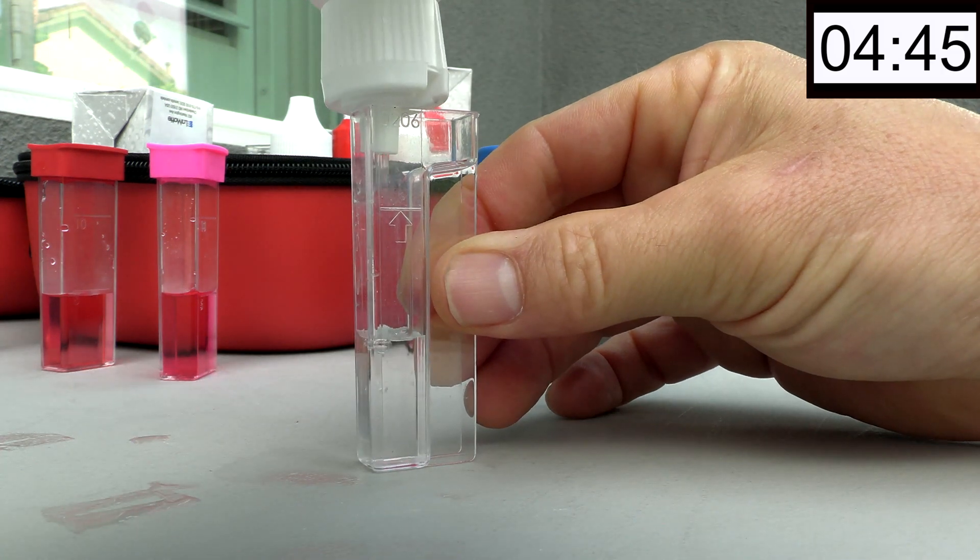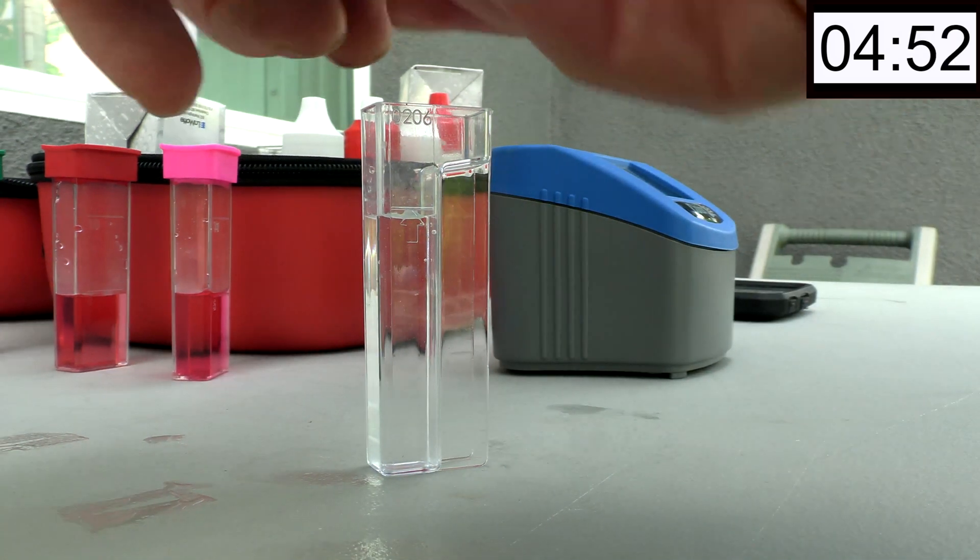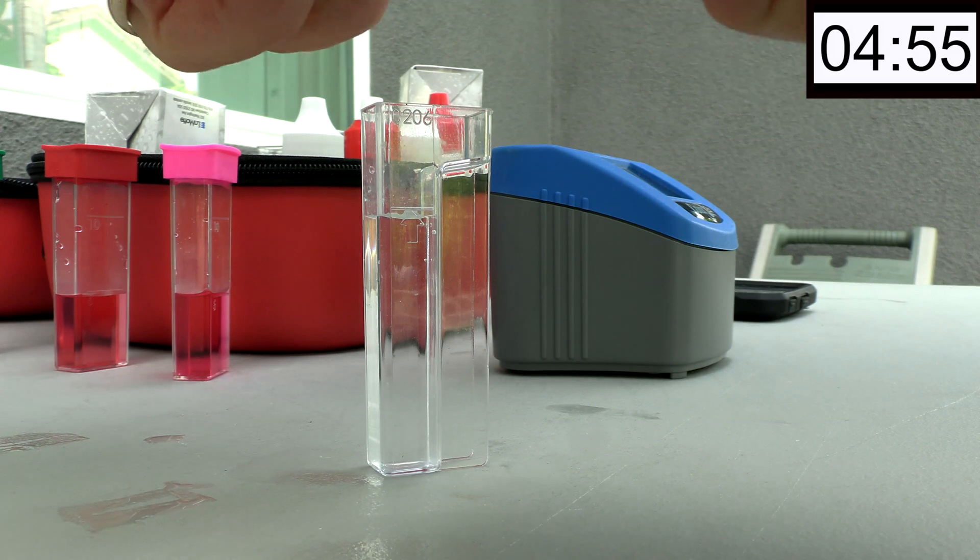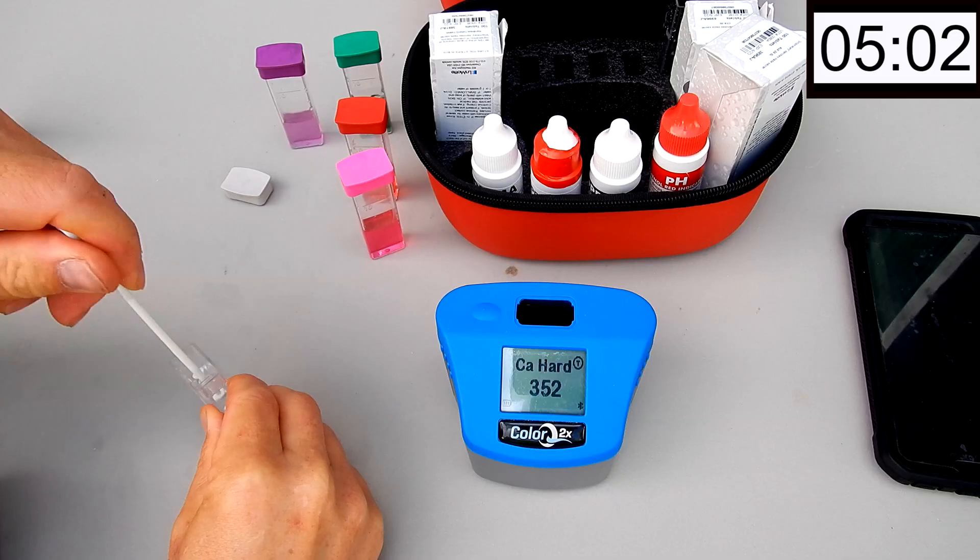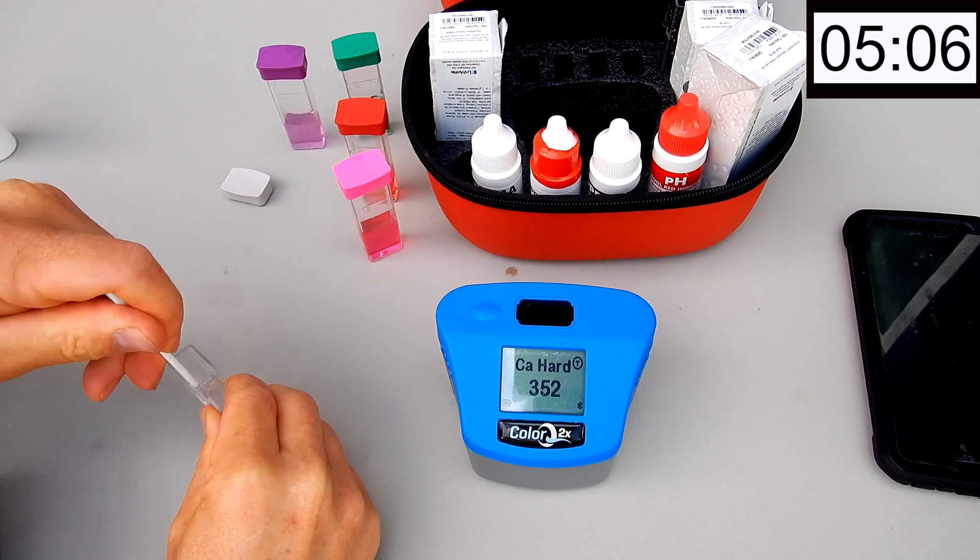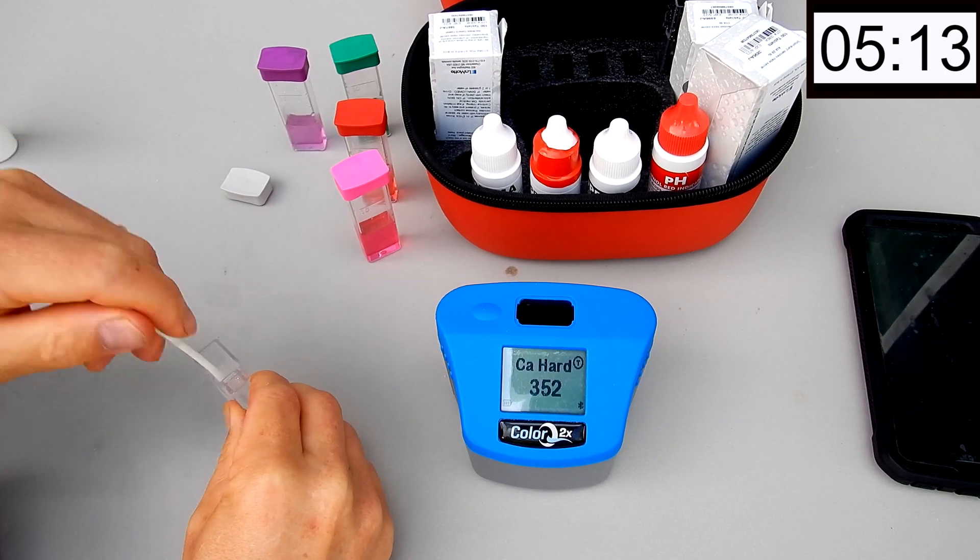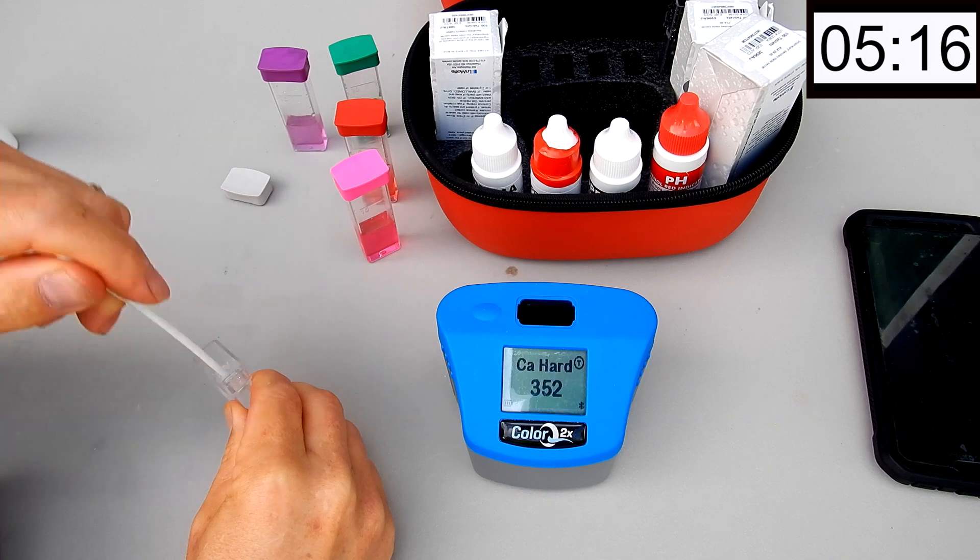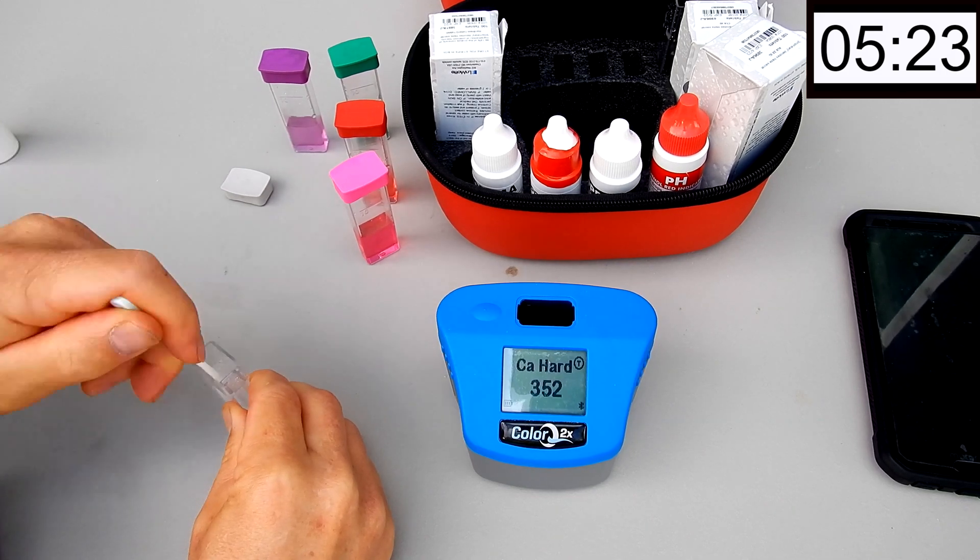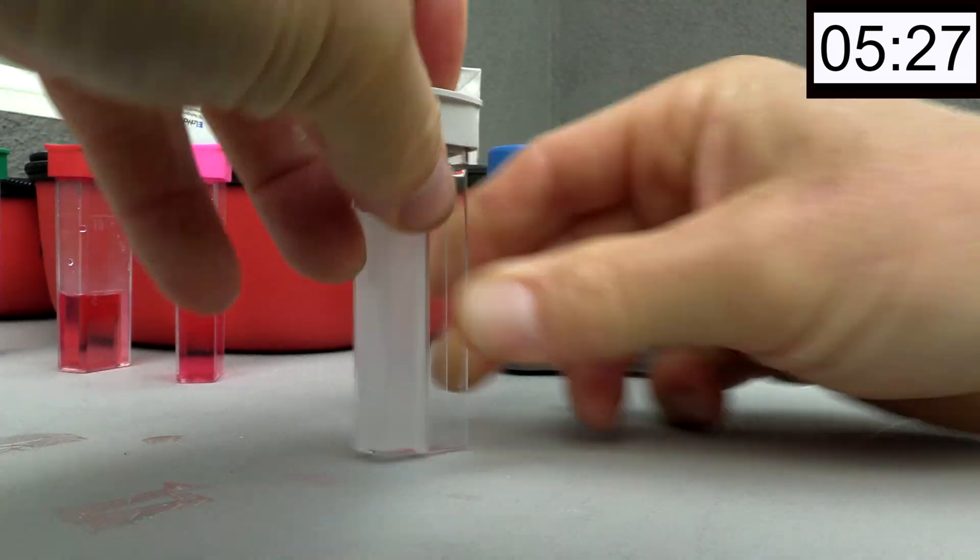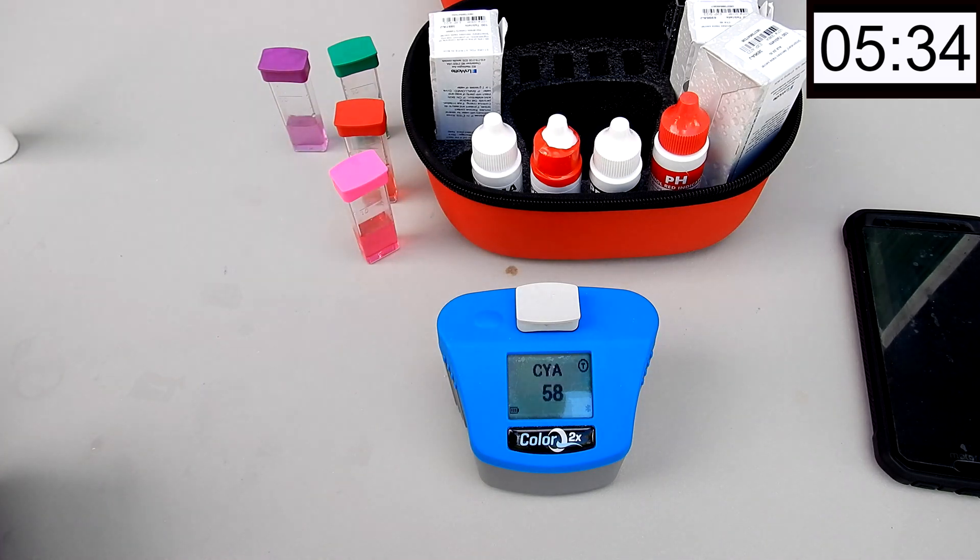This was a little bit different. I'll just fill it to the arrow. And the Cyanuric Acid has always been a tablet form with their other ColorQ Pro 7 kit. There's nothing new here as far as the Cyanuric Acid, except for the tube is a little bit different. You want to make sure you use this specific tube when you do the Cyanuric Acid test. Otherwise you're not going to get the right results. And the Cyanuric Acid is coming at a 58.